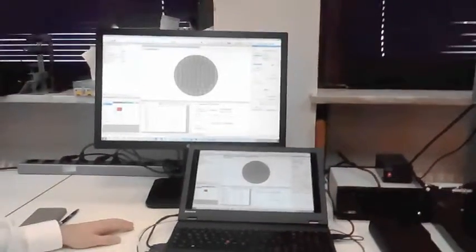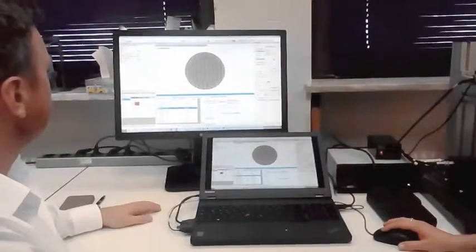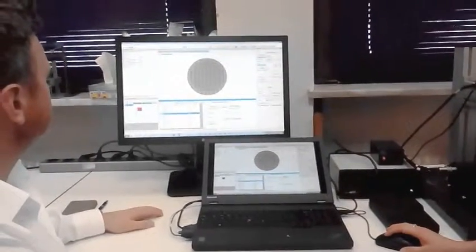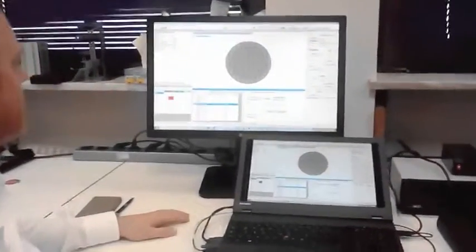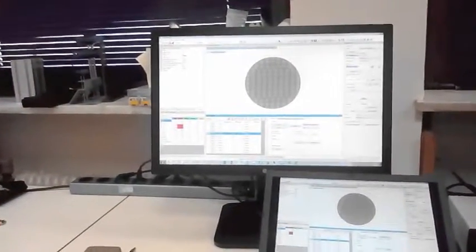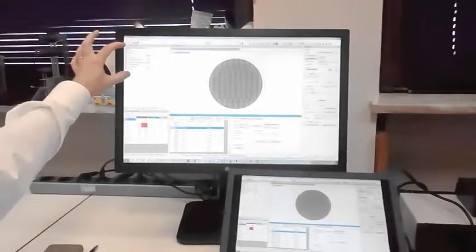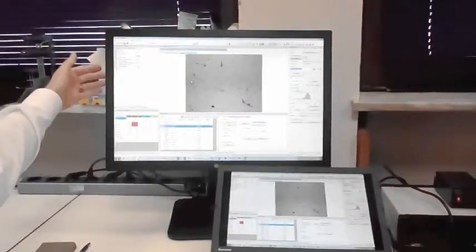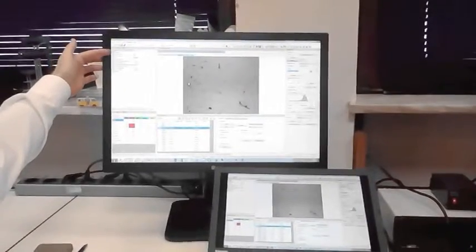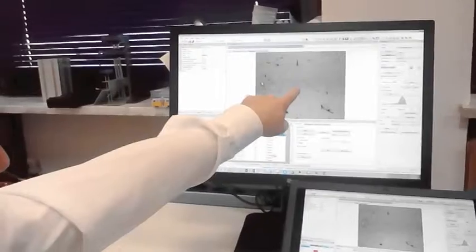Okay? And let's have a look at the window above. This window shows you more features, more details on the particles which we can select in the table. So whatever's highlighted here, you get this detailed view up here. Just for the video, we have the full length. We've got a little highlighted box around the particle here.